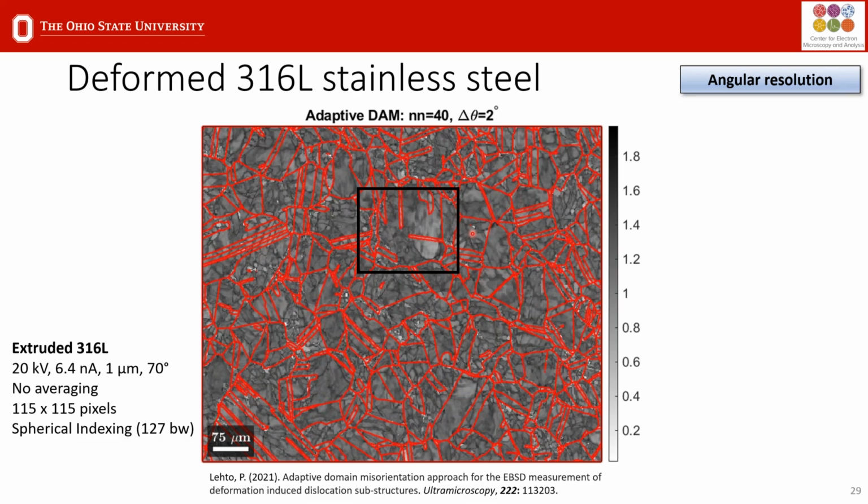Now, again, with this analysis, usually with normal EBSD maps, you have to apply lots of orientation filtering, and by re-indexing the patterns, you can get away with using much less of that filtering to determine the subgrains in the sample.